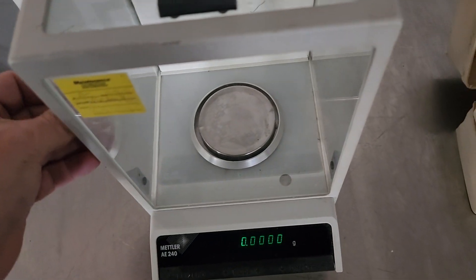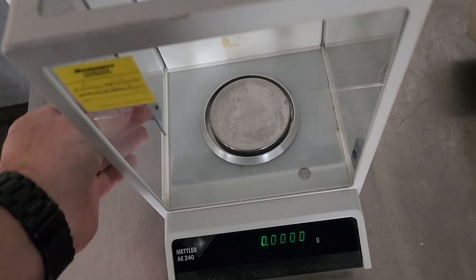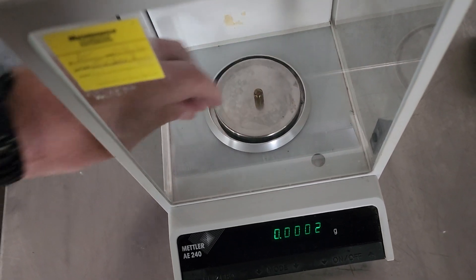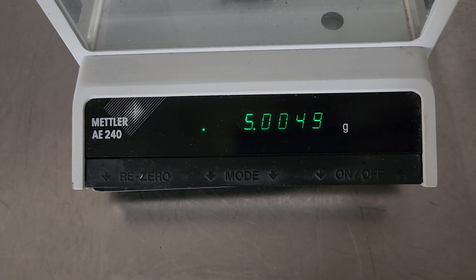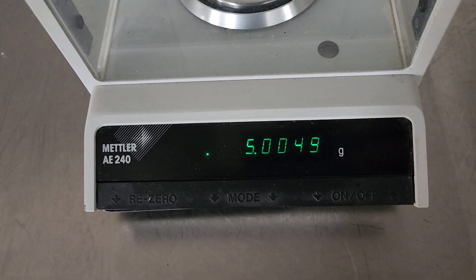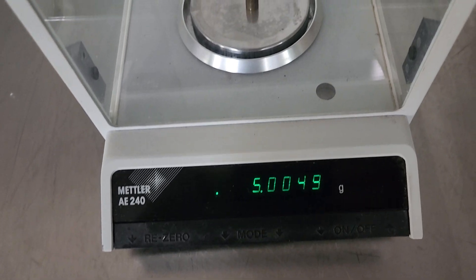We'll throw in a weight — no idea what size this is. I think this is a 1 gram, could be a 5. Yeah, it's a 5. You can see that's at 5 — reading 5.0049.